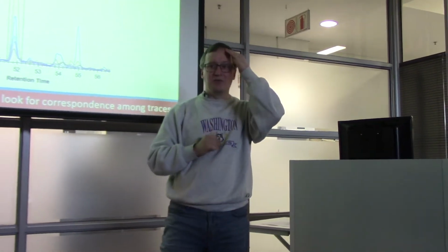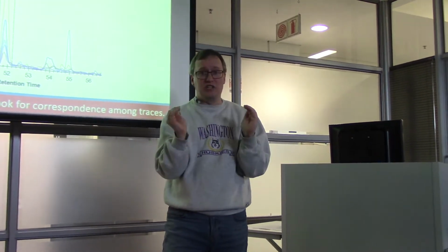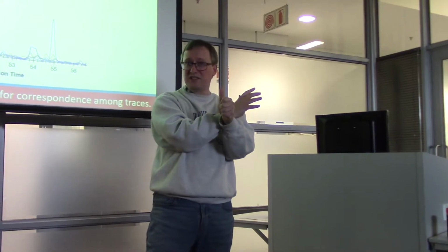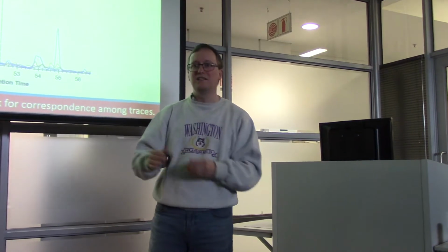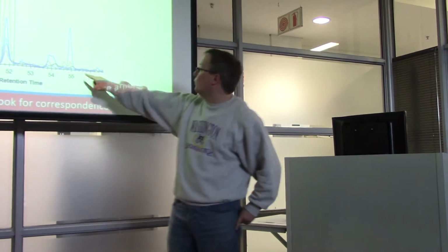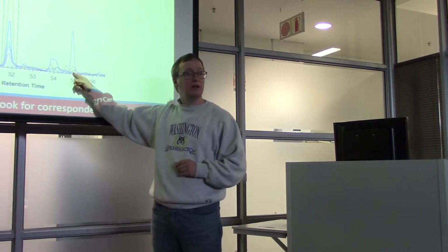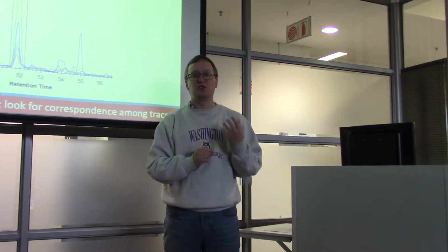And I want you to think about why that would be. The LC retention time for this peptide is common. I mean, that one peptide produces all 5 of those traces. Does everyone see that? These 5 transitions must be correlated together because this individual peptide is producing all of them. So over here, we see that the Y6 ion, this little purple trace, is showing up by itself down here. That's not where the peptide is eluting, because that one fragment shouldn't be seen by itself.